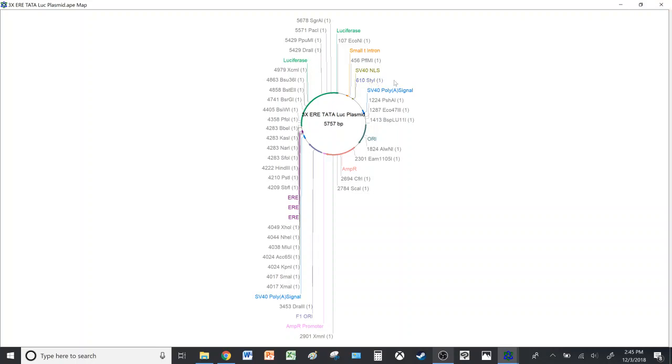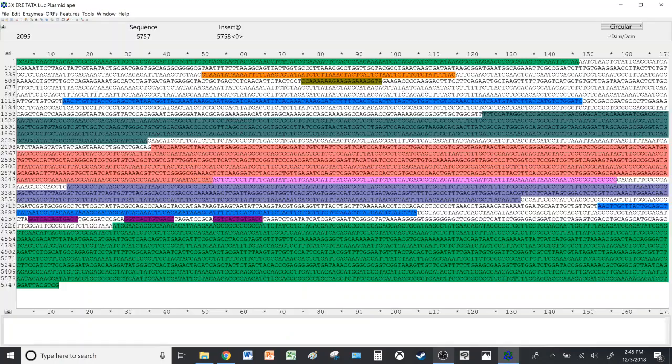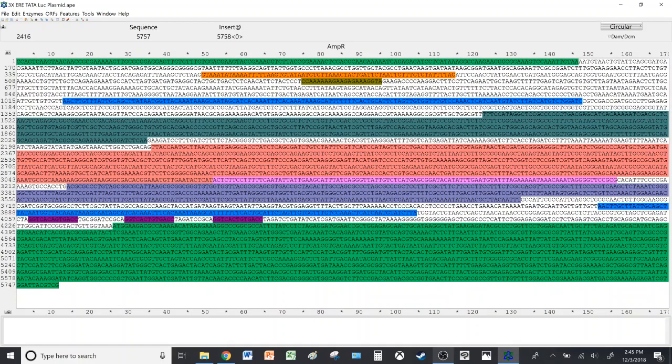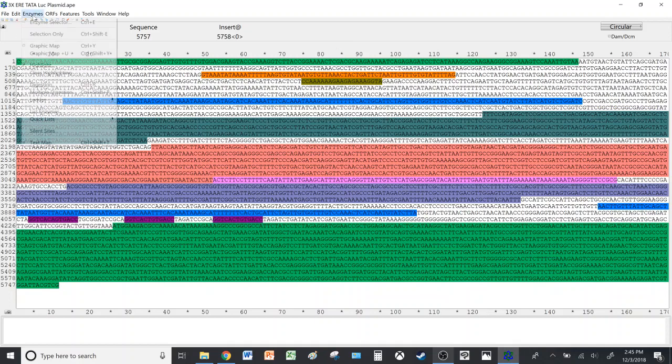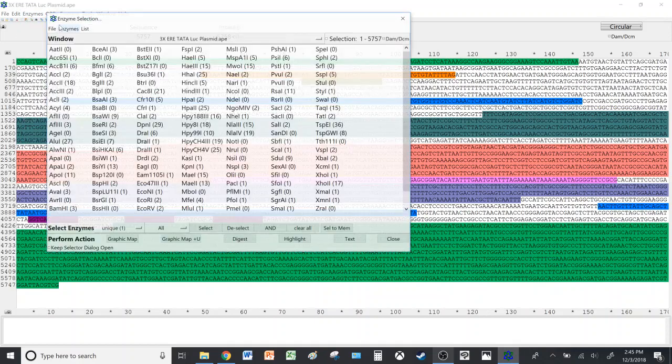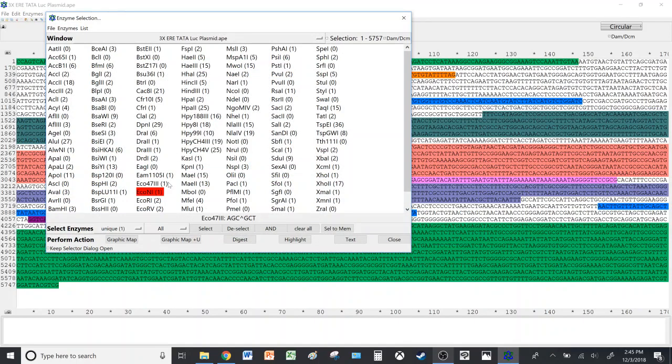So let's close this. Before we close it, we'll choose StyI, EcoNI, and HindIII for the demonstration. If you wish to select particular enzymes, you go to Enzymes, Enzyme Selector, and then you left click on the enzymes you wish to choose.